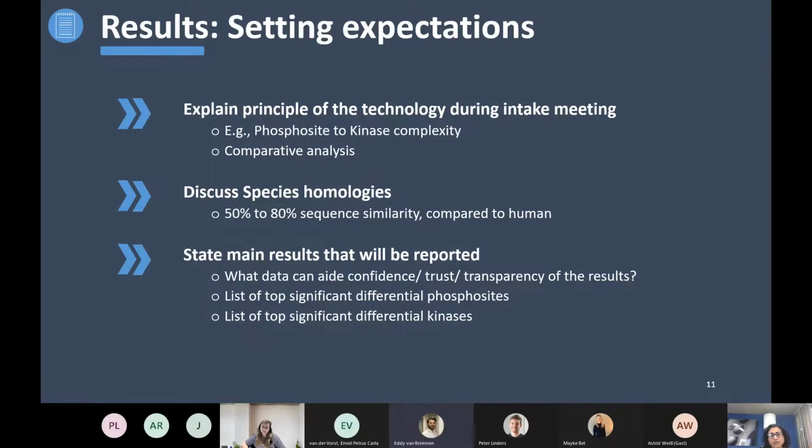And we also take into consideration the sequence similarity from, say, 40 or 50% up to 100%. So there are options where, during the analysis, we can change these settings a little bit to make it less stringent for other species, because we link to databases using the sequence information.